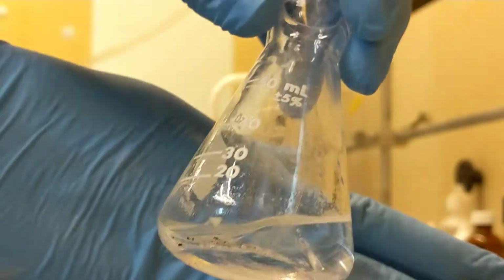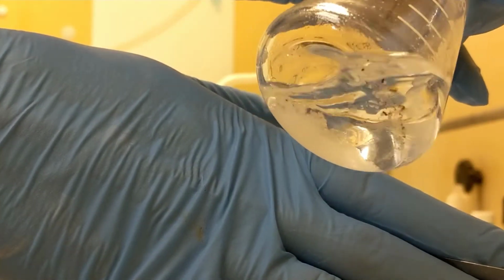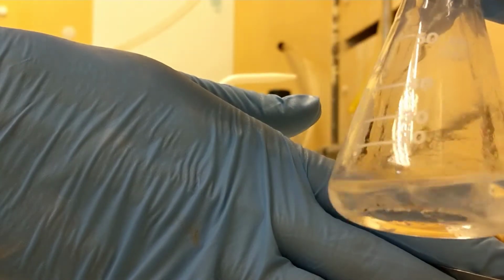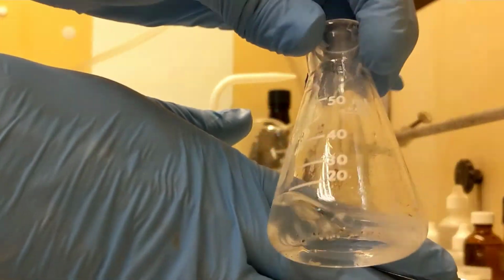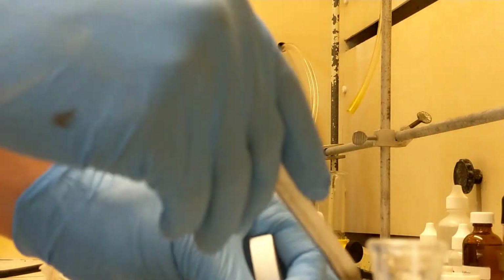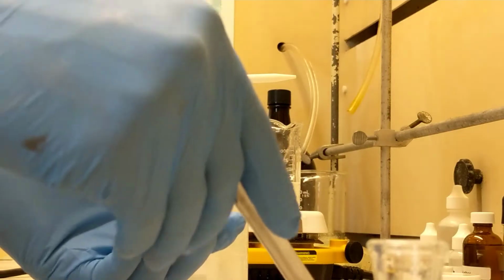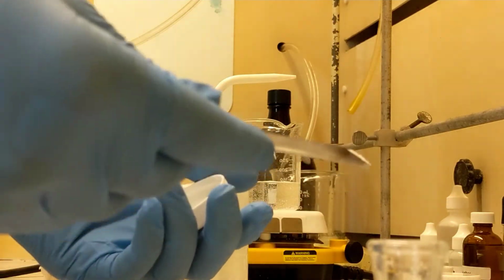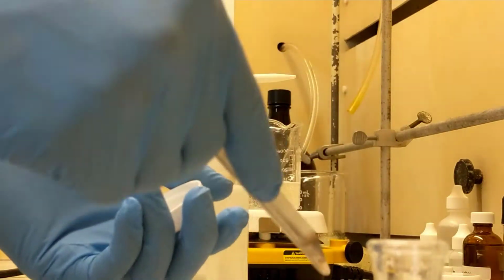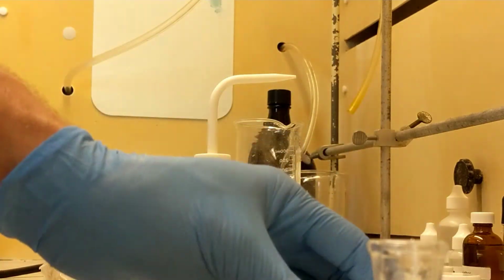And you can see there at the bottom, if I stir it up, spin it around, maybe a little bit of clumping, I'll add one more spoonful. But it looks pretty dry to me. And it's really something you just get the feel for. I know my first time doing it, I was pretty unconfident, but the more you do it, the easier it gets.